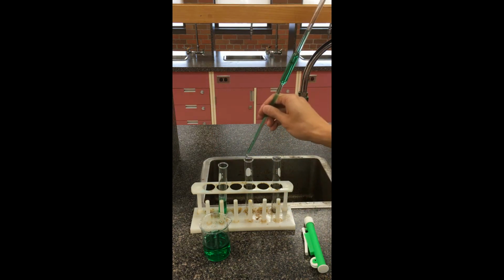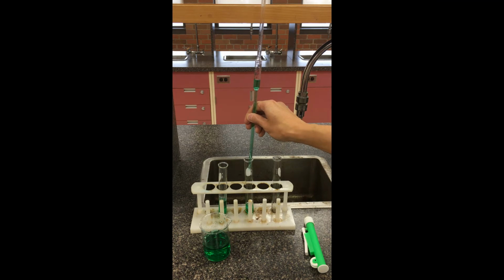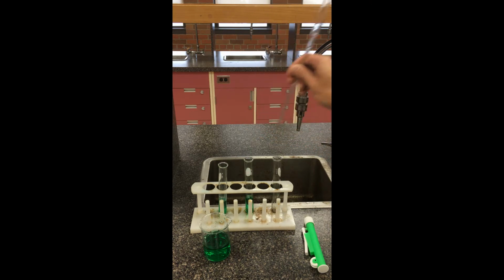Again, there's my second aliquot here. I'm going to fill in my second test tube. So there we go. Pipettes generally come in increments. They can transfer 10 milliliters at a time. I'm going to show you the last one here using a 25 milliliter pipette. Unfortunately, 25 milliliters is a much bigger volume. So what you're going to need to do is use the suction bulb here twice.